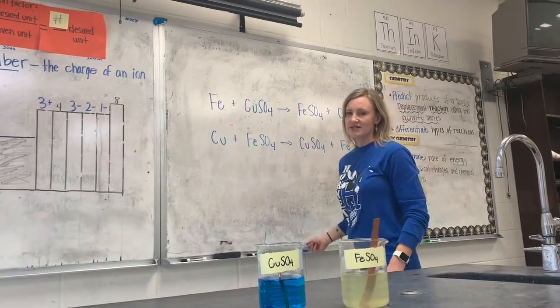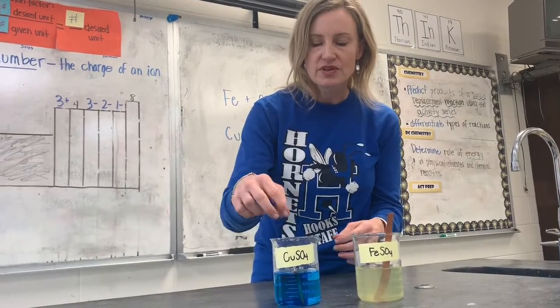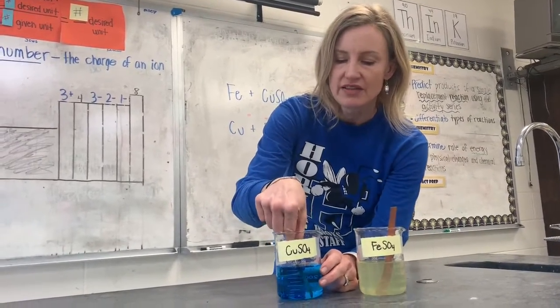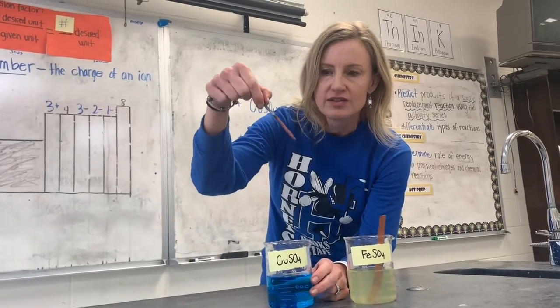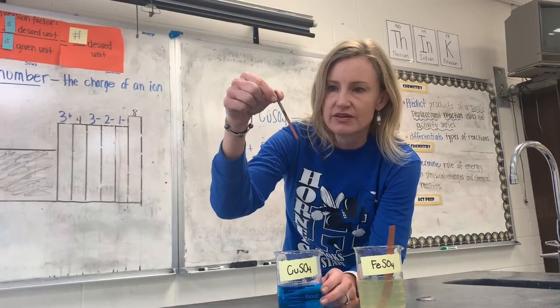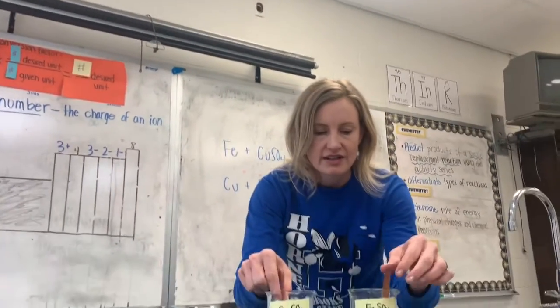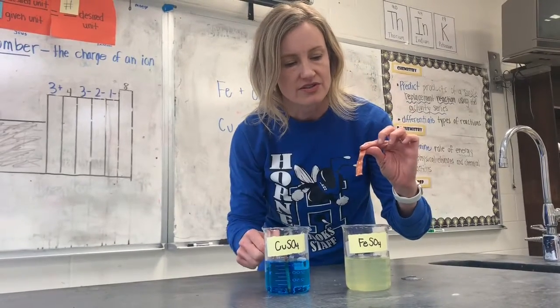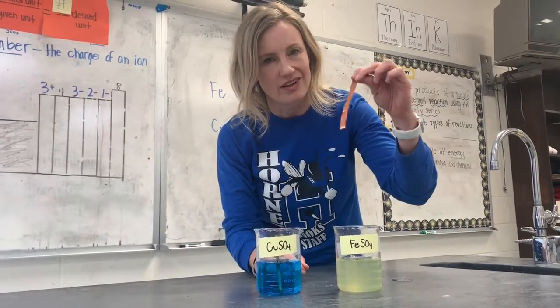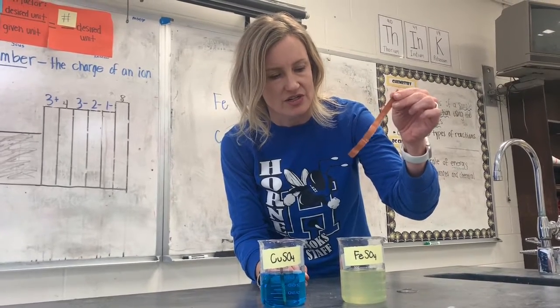Let's go back and see these reactions. So let's look at the copper sulfate and the iron. Can you see what happened? Any ideas what that is on there? It's kind of a copperish color. Let's look and see on the iron sulfate. Well, look on the copper, it doesn't look like it's really changed at all. There doesn't seem to be any change.